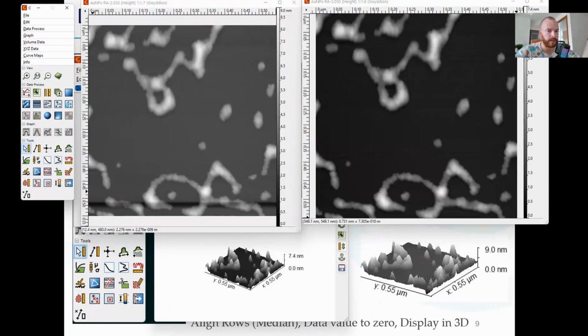So SPM is what? It's scanning probe microscopy, not only atomic force, but probe. Probe means Kelvin probe microscopy, magnetic, whatever forces microscopy, and so on and so on. Any of them, you are dealing with a difference.